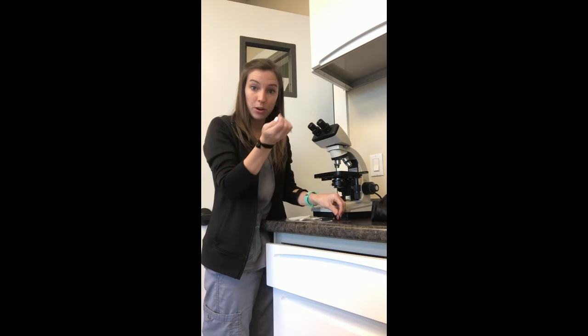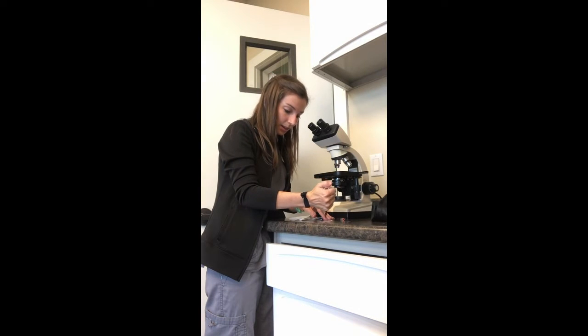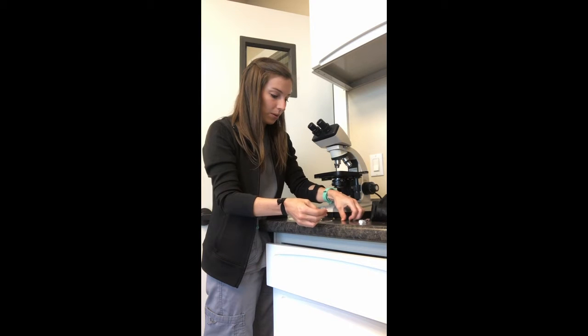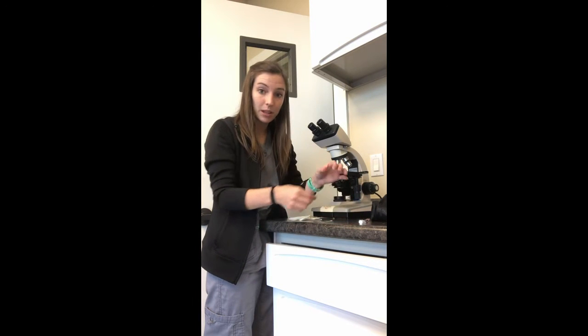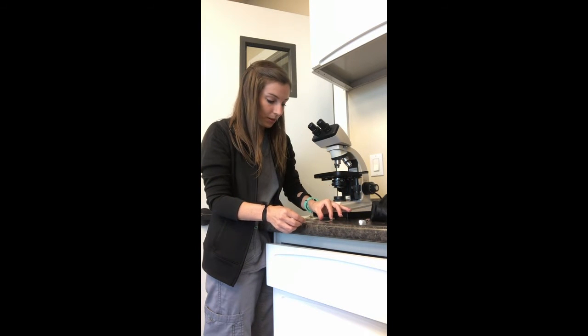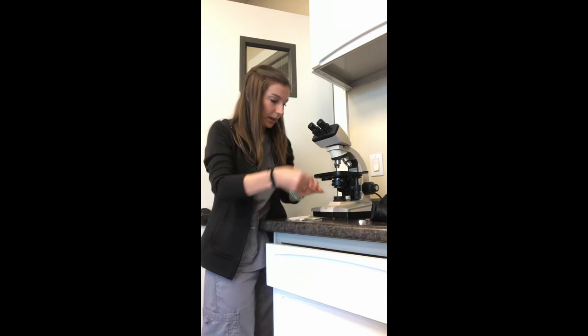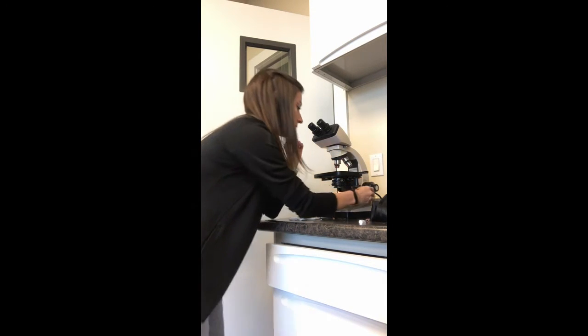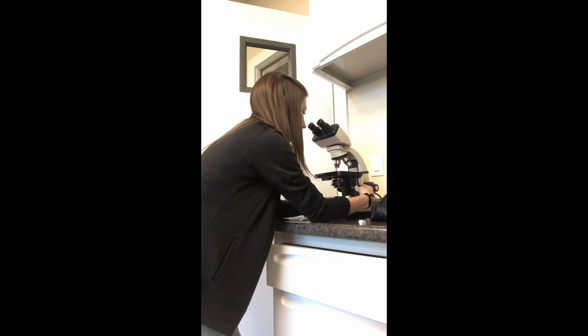I will now be performing a direct heartworm test. In order to do this, I will take one drop of whole blood, place it on a slide, cover that slide with a cover slip, and then go to my microscope, starting out on the lowest power.